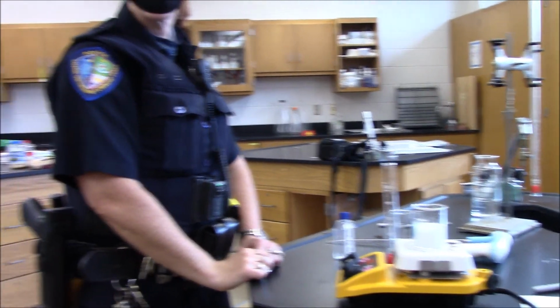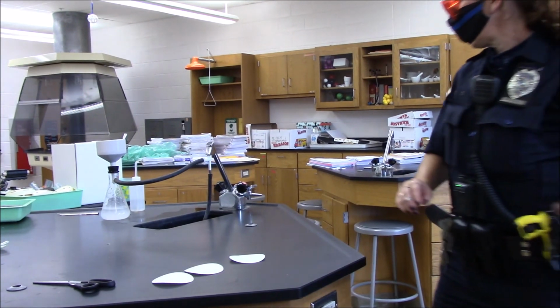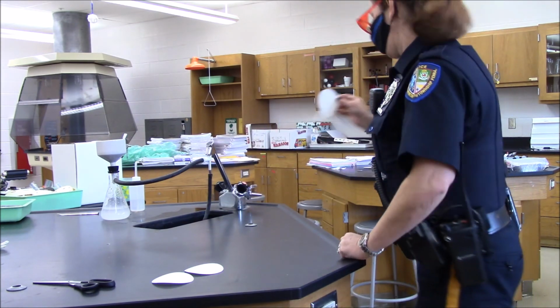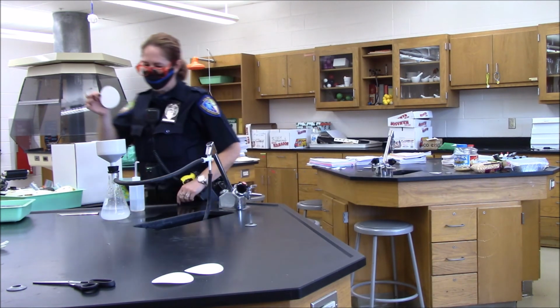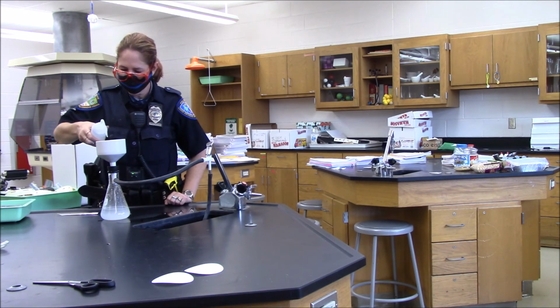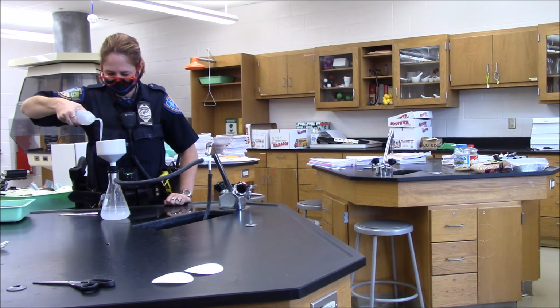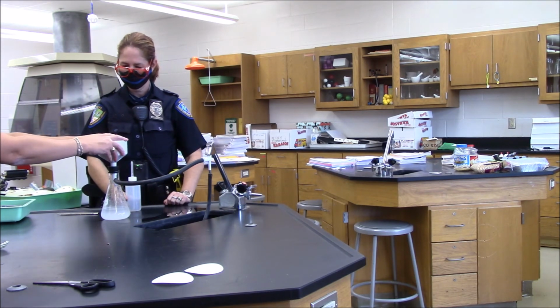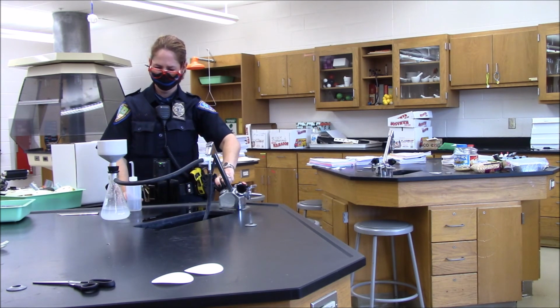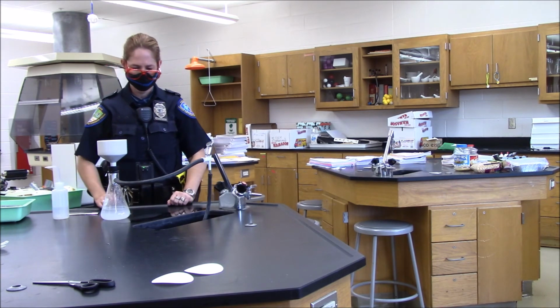So now we're going to let that stir for a second, and we're going to come over to the filter apparatus and get it ready. We're going to find the filter paper that says number 4, and put it in the white funnel. You can squirt some water on there. Excellent. And you can turn the water on all the way. There we go. So we can see that the water's coming out. All right, and now we're ready to filter.